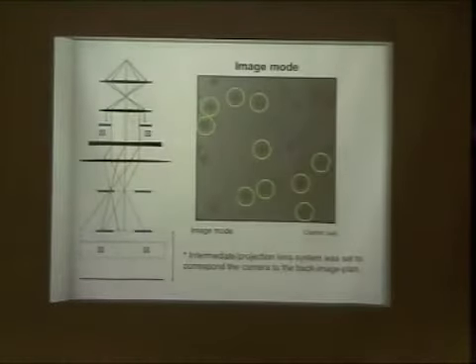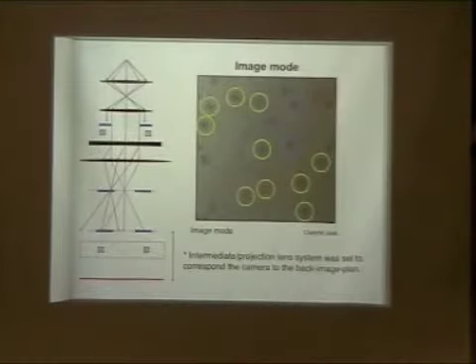Now, that's why in electron diffraction it's so simple to switch between the image mode and the diffraction mode. In the very first generation of microscopes, it was only able to do electron imaging. At that time, the diffractometer and the imaging were two separate machines, until the things got combined together and you can do these things easily.